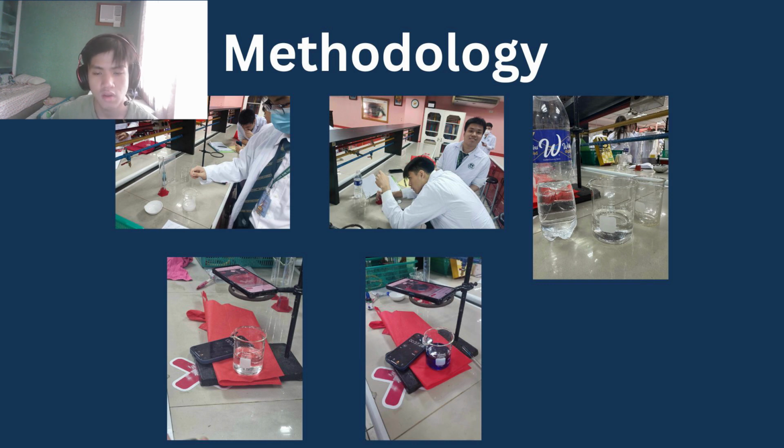Next, to determine the amount of water required, we refer to the density of sodium carbonate, which is 2.54 grams per milliliter. Using the formula P equals M over V, or density equals mass over volume, the volume of sodium carbonate is calculated to be 4.17 milliliters. Subtracting this from 100 milliliters provides the amount of water needed, which is 95.83 milliliters. Upon completion of these calculations, we are left with the 1 mole solution of sodium carbonate in the beaker.